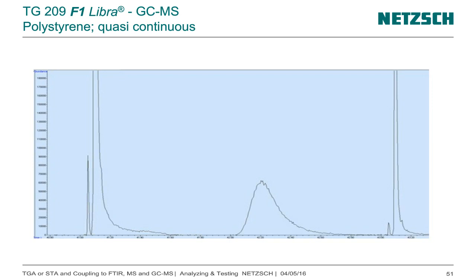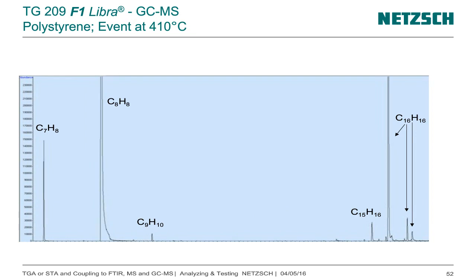You could for sure gamble a little bit with the temperature of the furnace, or you do an event control measurement. And in the event control, I showed you here the toluene, this in the beginning, then the styrene, and some other substances, and several with mass number 208 as the highest mass number, so several different dimers of the polystyrene.